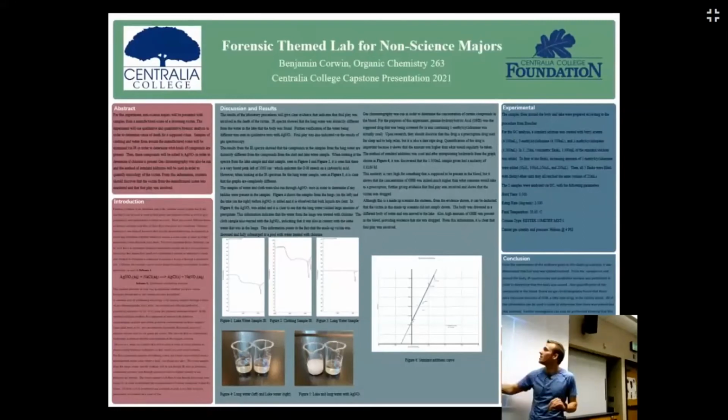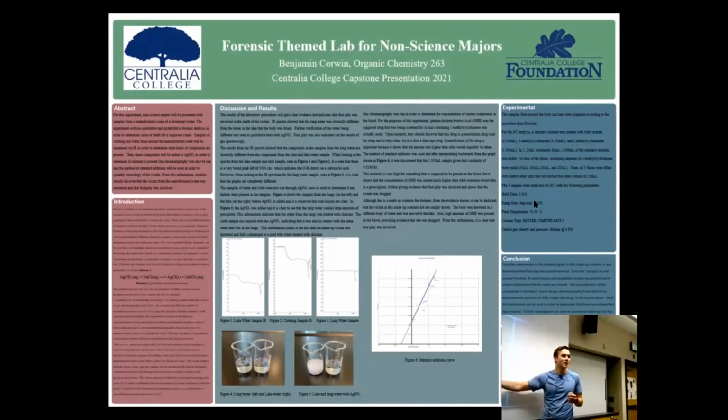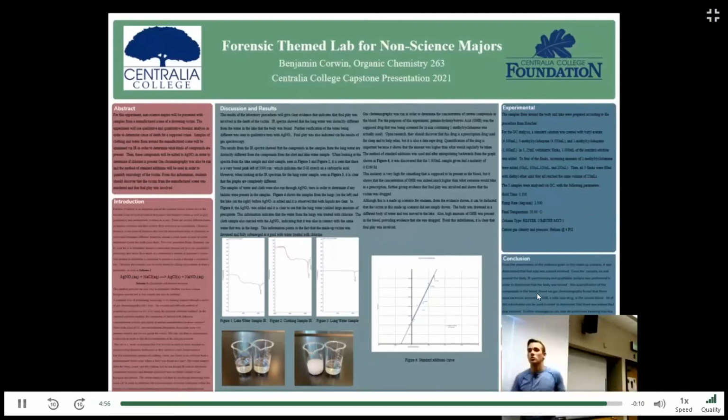So we would have that the body was moved and that there were drugs involved. The whole goal of this experiment was to determine if foul play was involved, and it was proven that foul play was involved. Now from this, students can take their data and write a report on it. The goal was achieved, and overall it was successful, and it was done in a way that they can learn about the chemistry behind it while still applying it to a real world situation.